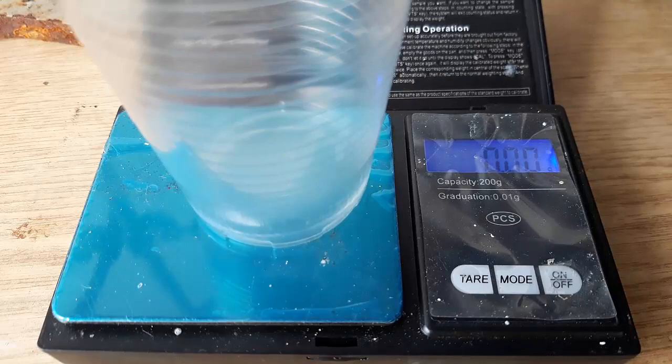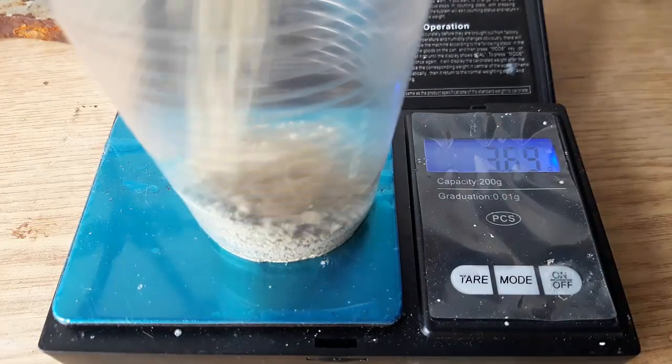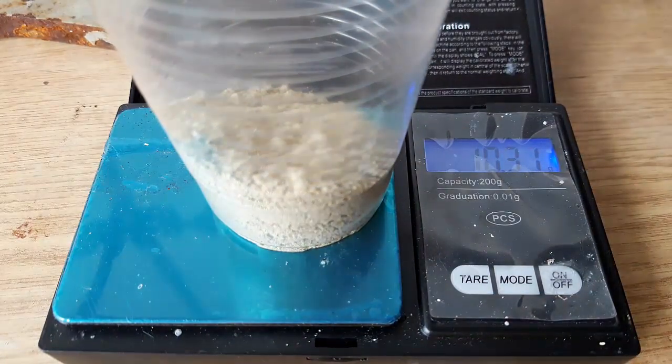After letting it dry we weigh it. We got about 10.3 grams out of the theoretical 10.8, which gives us a 95% yield based on resorcinol.